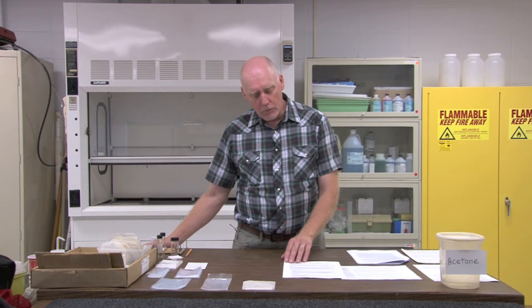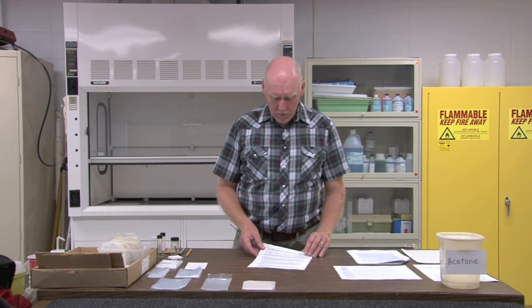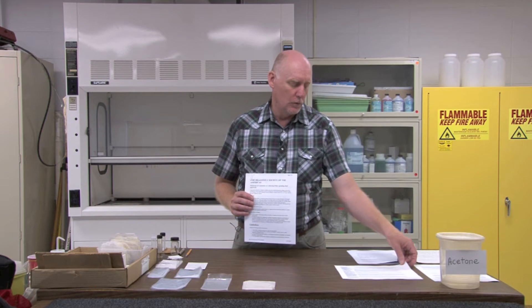Today I'm going to be talking about how to preserve dragonfly and damselfly specimens. We in the DNR use citizen monitoring volunteers to collect data for various plant and animal species, and we do that for dragonflies and damselflies as well. We have a website and collect much of our data from citizen volunteers. In order for citizen volunteers to participate in our survey in a meaningful way, you may have to at some point retain some specimens. We follow the collecting procedures for animal care that are outlined by the Dragonfly Society of the Americas and also the Worldwide Dragonfly Association, and you can find both of these documents easily online.